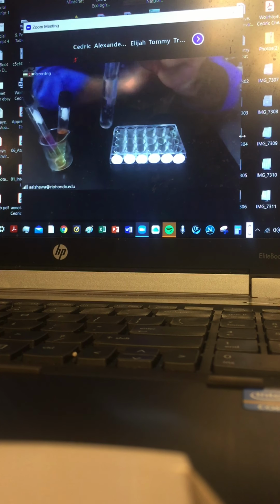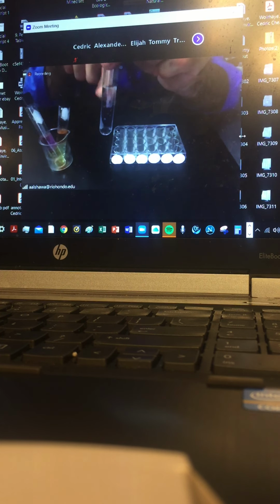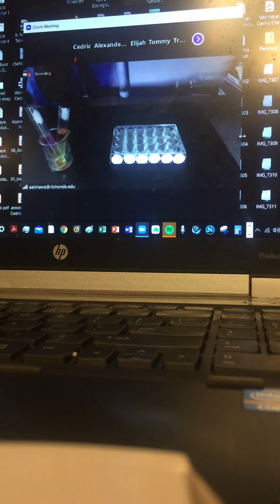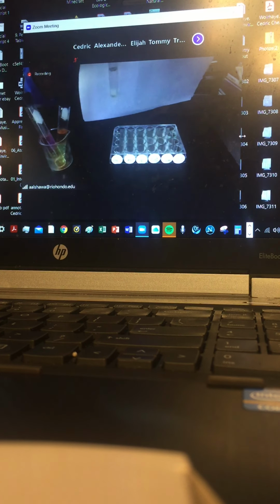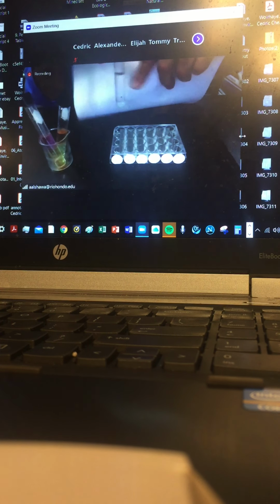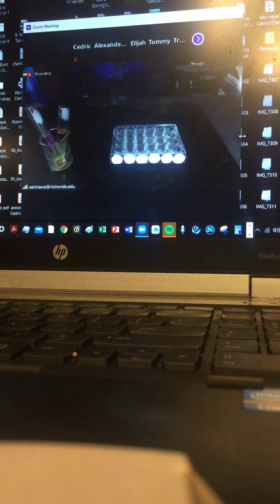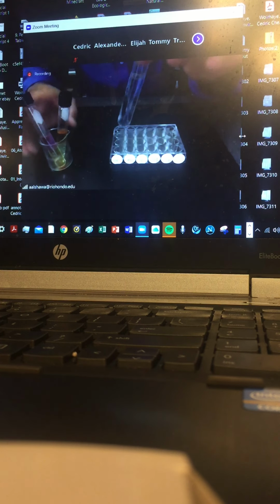So that's the color of hexane and that's the color of chlorine in the hexane. Either you can say, well, clear, because I can't see that hint of yellow, or sometimes you can detect it, depending on how sharp your eyes are. Can you see that hint of yellow in the top hexane layer? Maybe or maybe not, because I can't see it. So that's the chlorine and hexane.